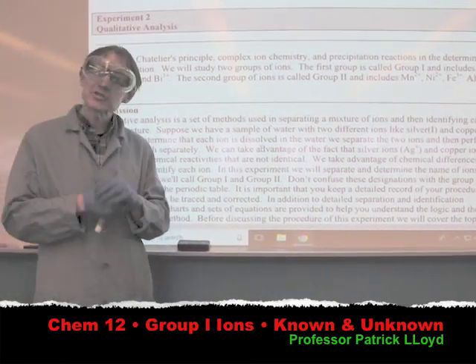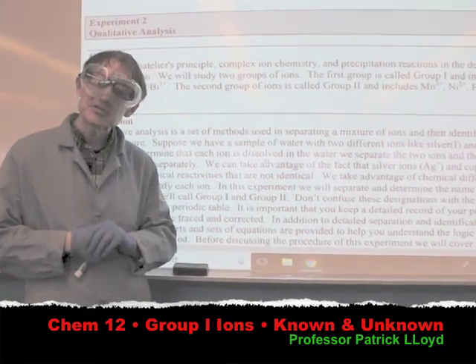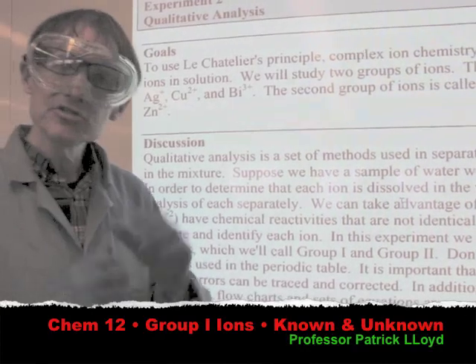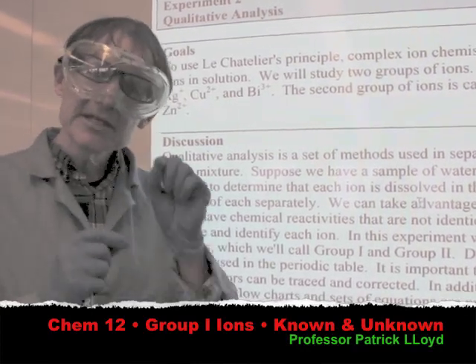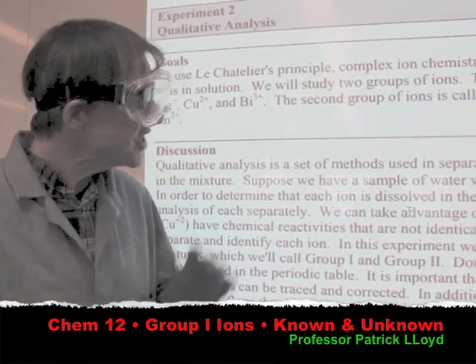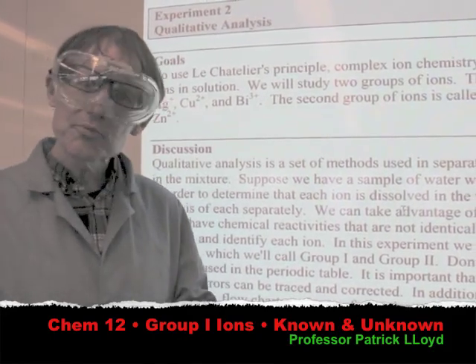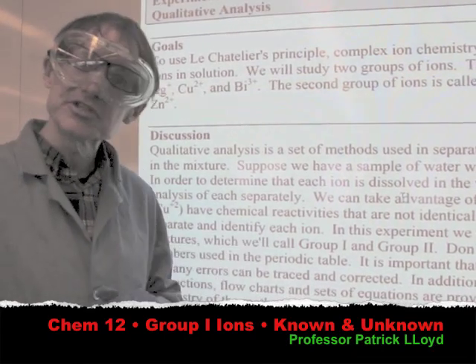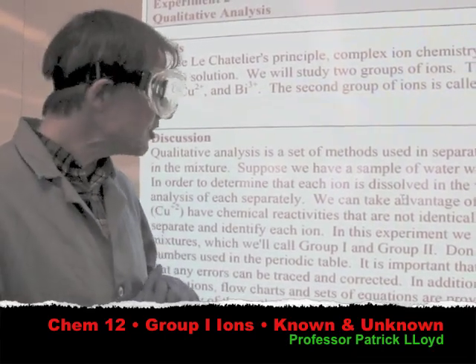So what we're going to do is use several different standard methods of analysis in chemistry to separate chemically the ions by using their specific reactivities, and then using physical processes such as centrifugation in order to actually physically separate them so that we can analyze them.